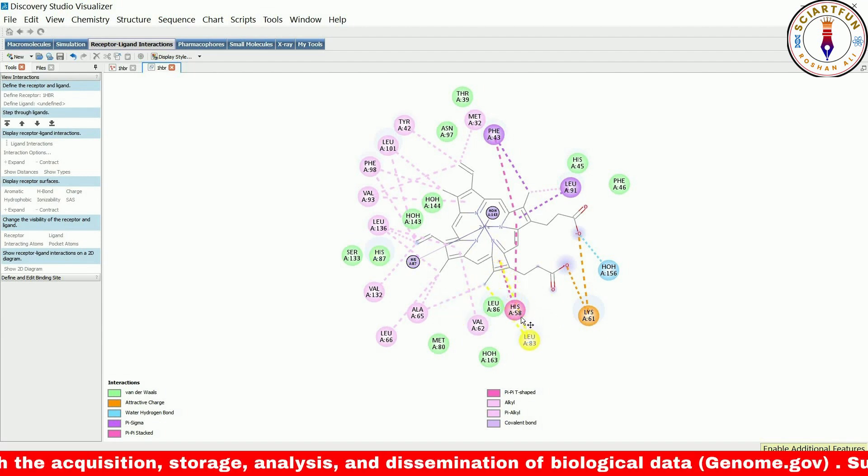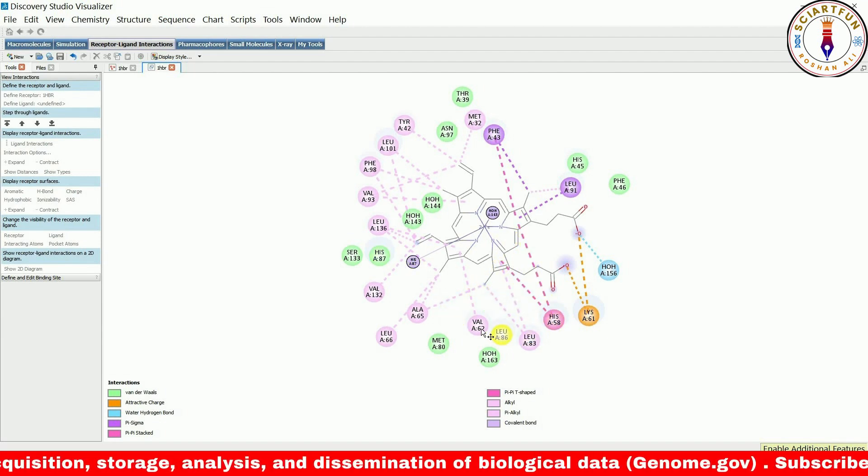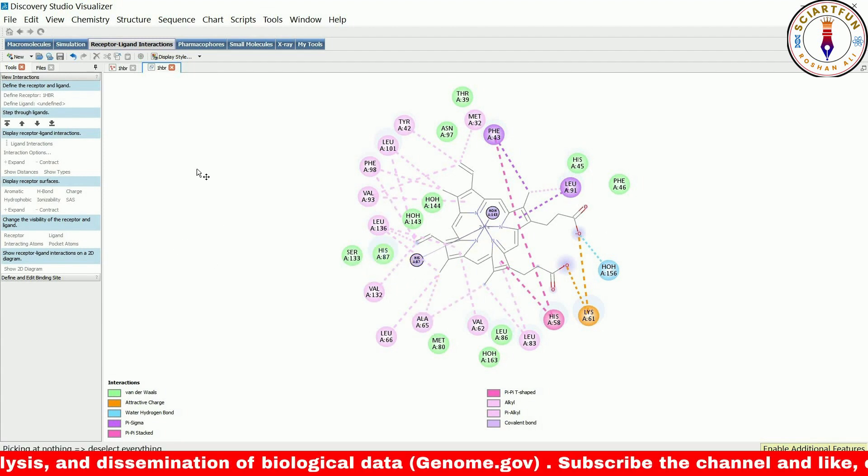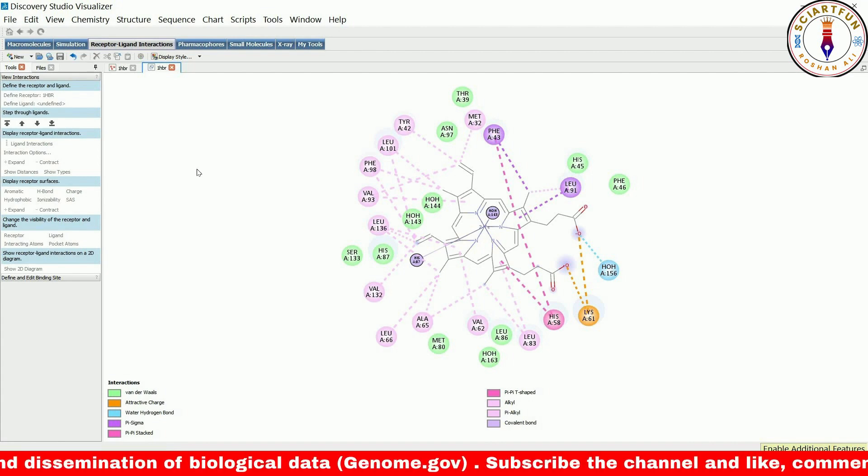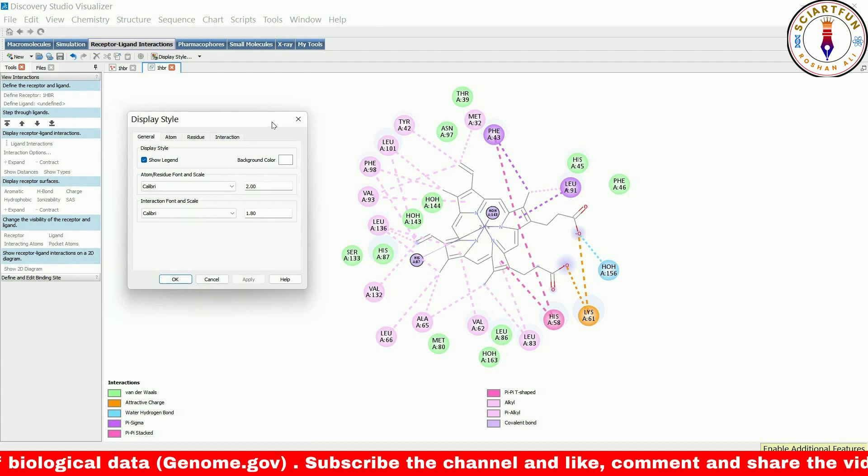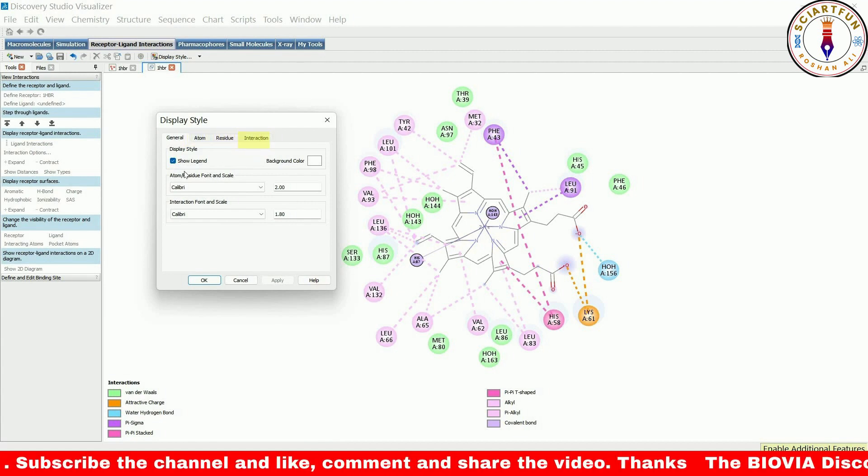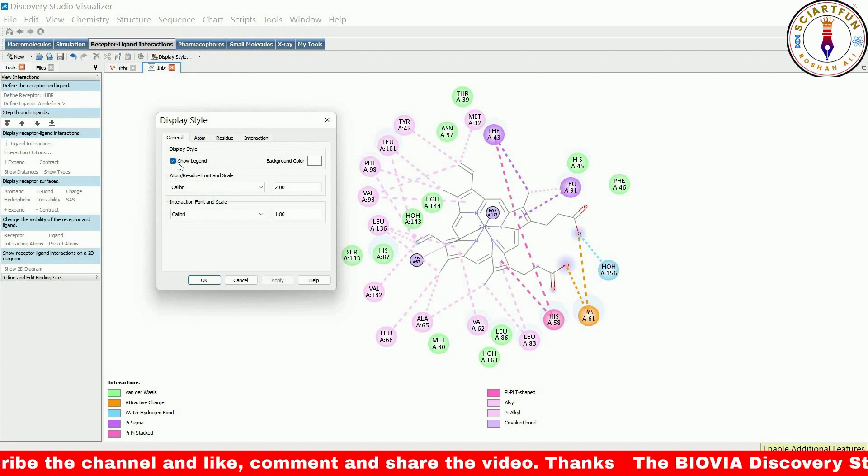Next, we will show you how to change the appearance of the 2D structure using the display style dialogue options. You can open this dialogue by going to the view menu or by right-clicking. This dialogue has four tabs: general, atom, residue, and interactions. We will go over the use of each tab one by one.